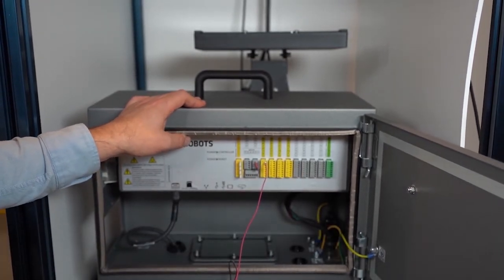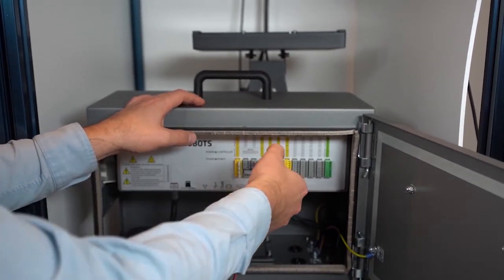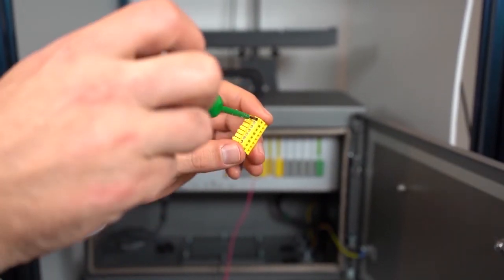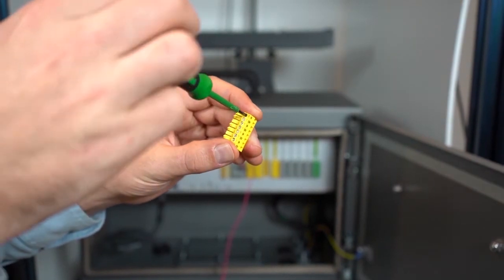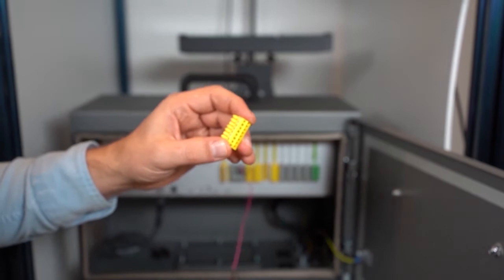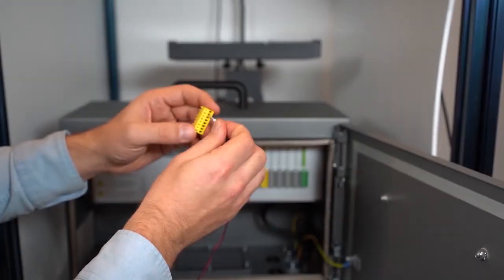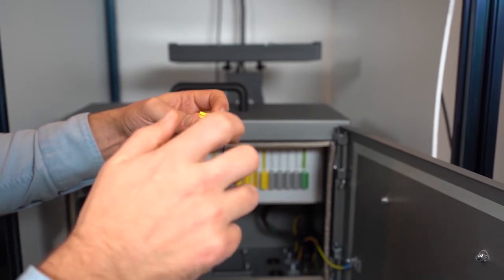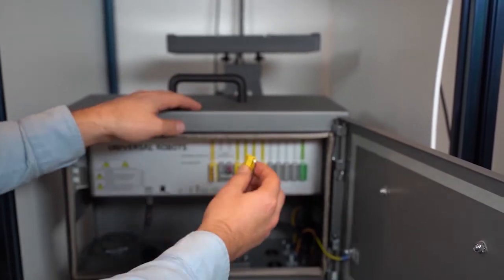Now, remove one of the 0V terminal blocks, and use the 2mm slotted screwdriver to loosen one of the 0V terminal connectors. Insert the black wire and secure the wire. Now, push the terminal block back into place.